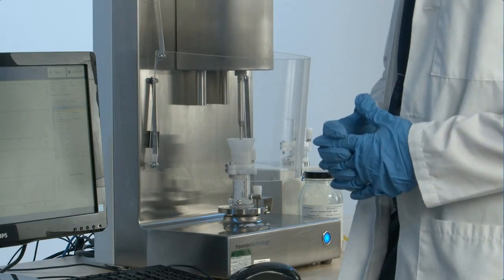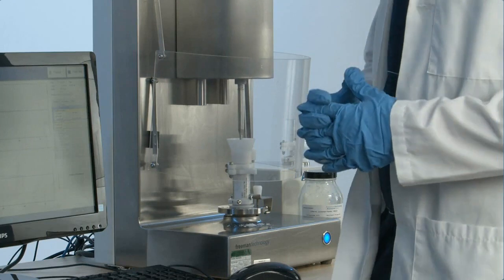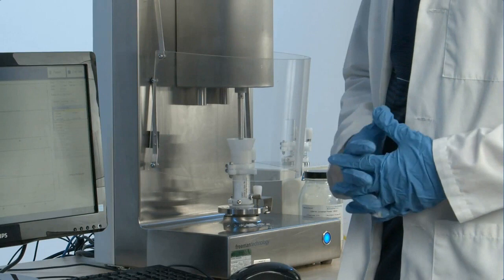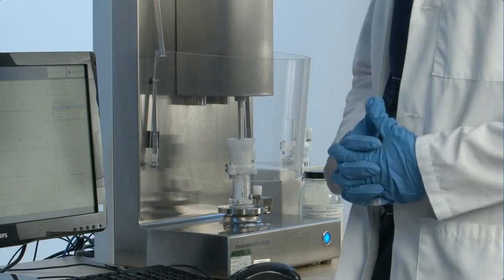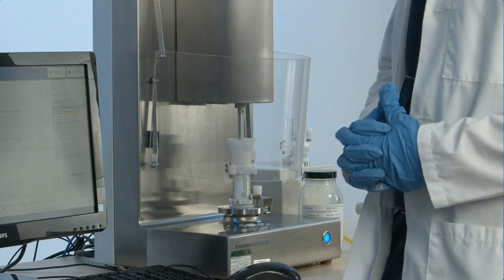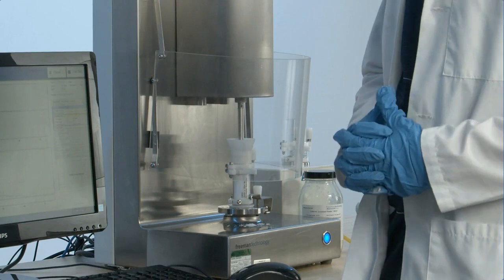And so that's what the conditioning step is doing. We are removing any influence that I gave to the powder during its loading stage and gently displacing the powder so that it is homogeneous and will have much better reproducible data when we record the flow measurements.